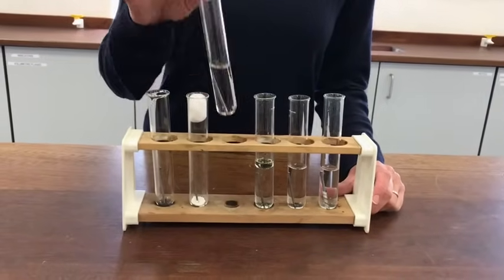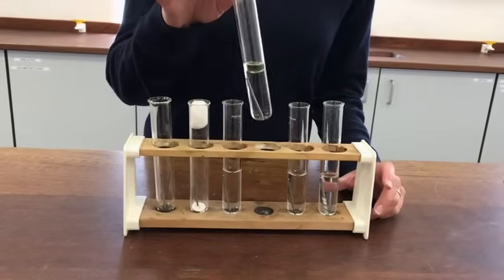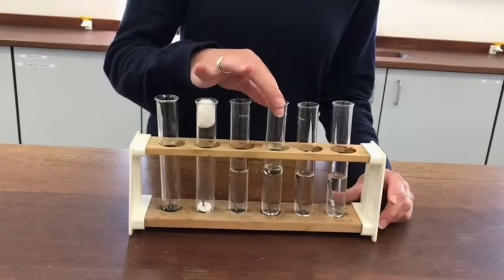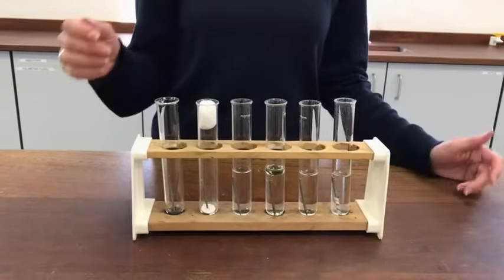Tube C has just got a nail and just tap water in it. Tube D here has the nail with some boiled water and then there's a layer of oil put on the top. The idea of boiling the water is it removes any dissolved oxygen from the water, so it really is just water — there's no dissolved oxygen there at all.